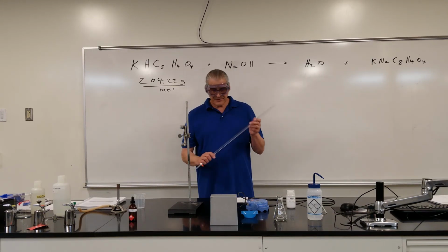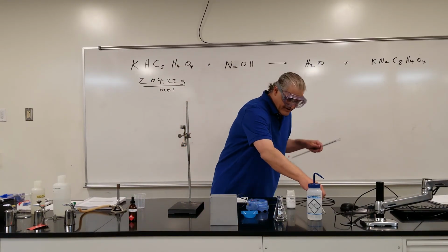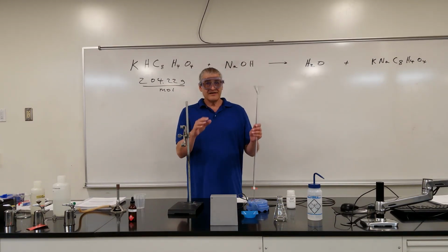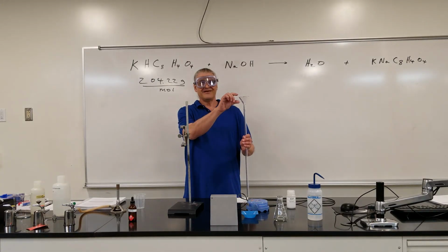Now, handling a burette, filling them up, different ways to fill burettes. Some people will use funnels. I do not recommend that. If you try to fill with a funnel, your burette will end up being full, your funnel will be full, and you'll make a mess.